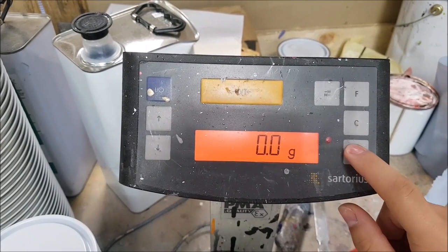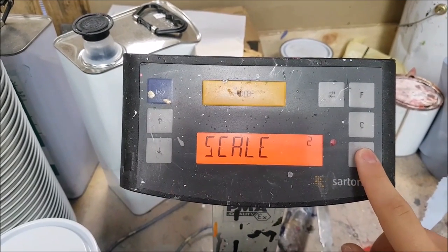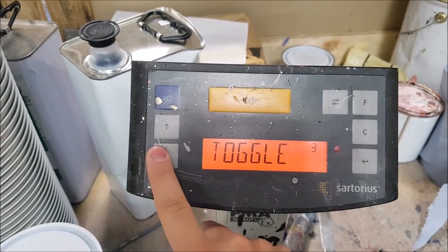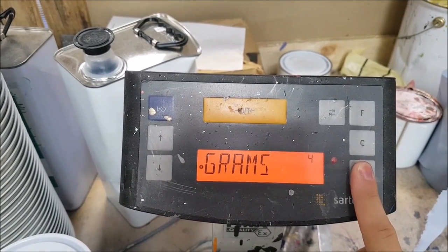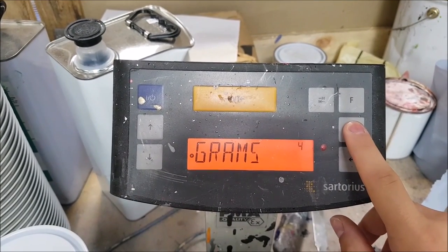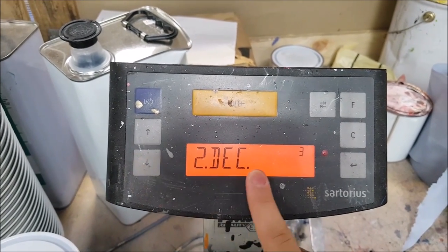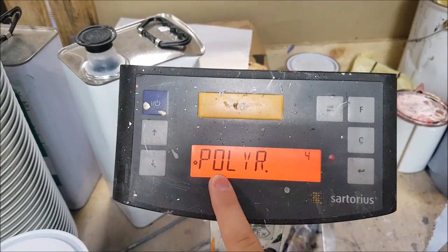Press and hold enter to enter setup, go down to application, then go down to unit and make sure that's set to grams. Click cancel, then scroll down to decimals, press enter, and make sure it says polyrange.